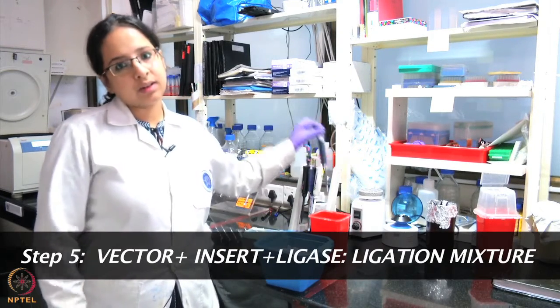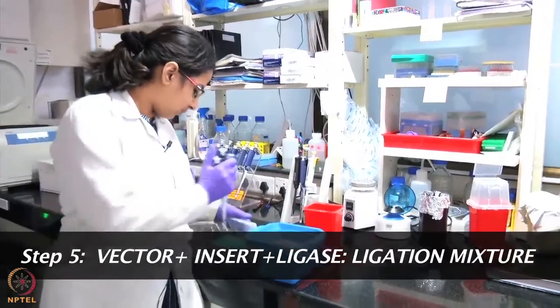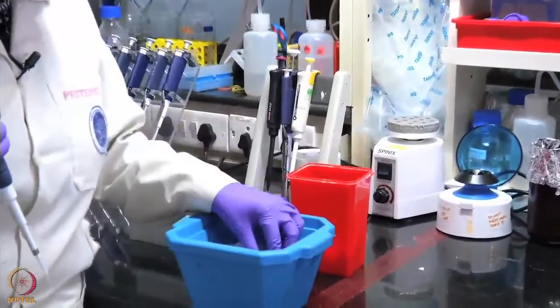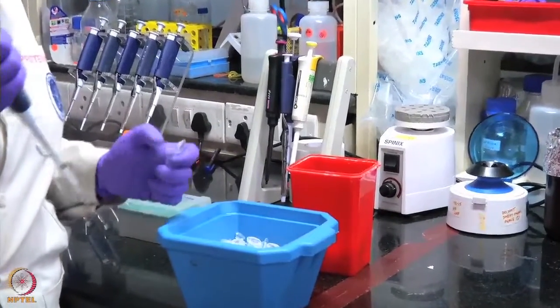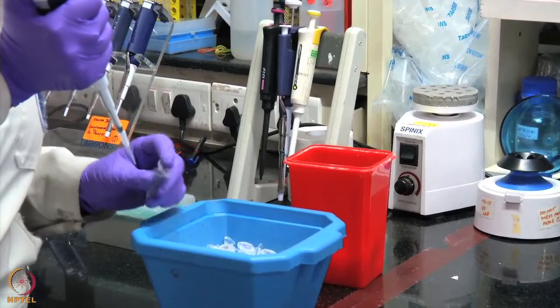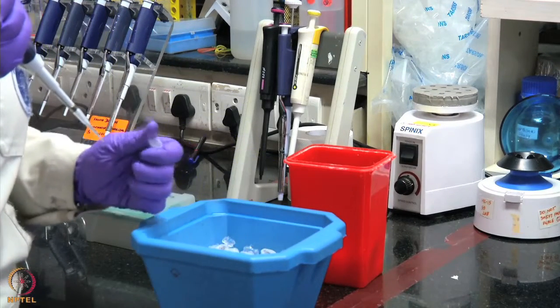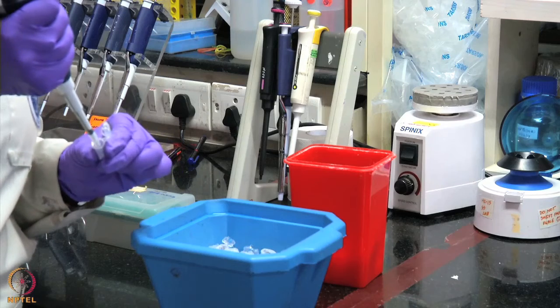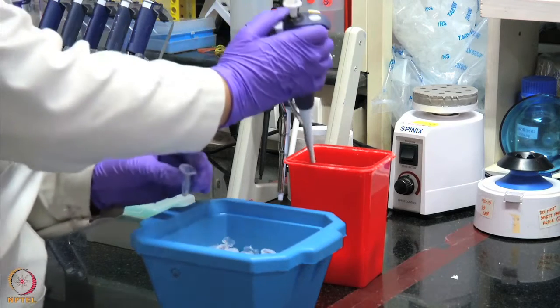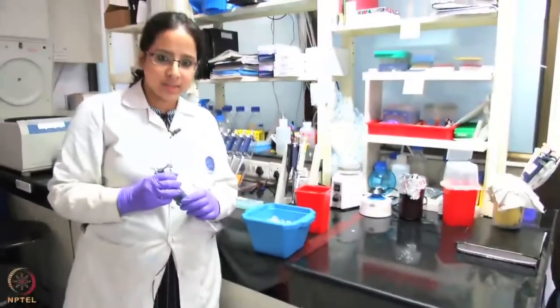First we'll take our vector DNA. Then we will add the insert.